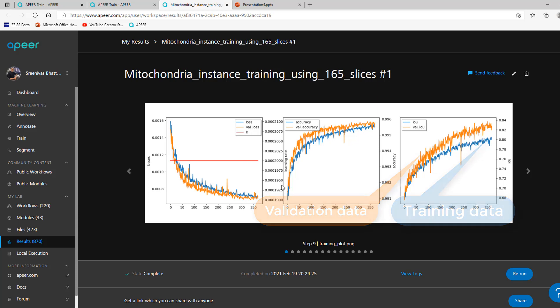These plots show loss, accuracy, and IOU, which stands for intersection over union, all as a function of epoch number.